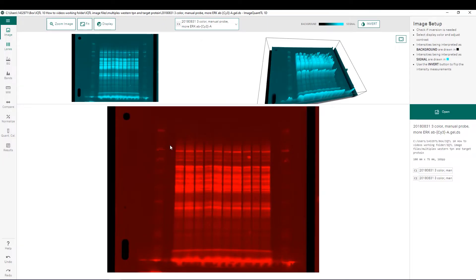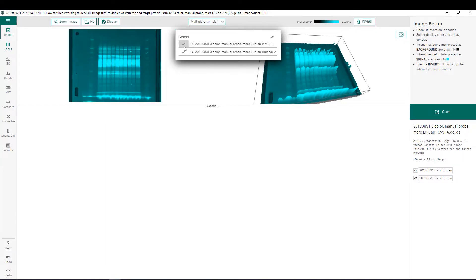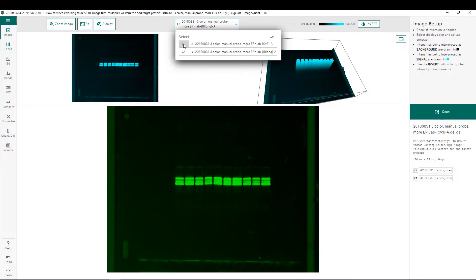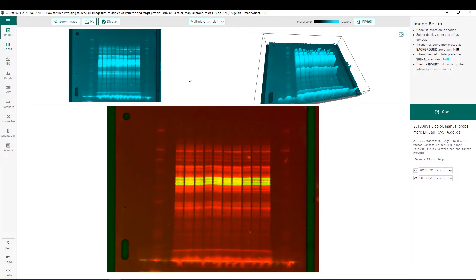Now that we have it open, we can see that we can choose which channel is currently being displayed in the image window. Right now we have chosen the total protein load channel, which was generated using the Amersham Quick Stain reagent. The other channel has our protein of interest. We can also choose to have both channels displayed at the same time.